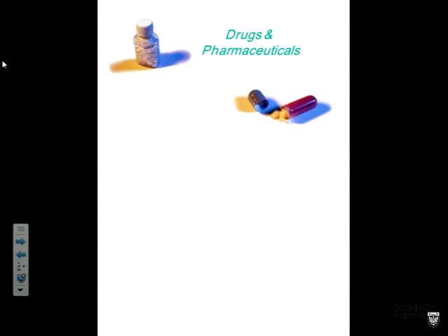Drugs and pharmaceuticals: separation science here is enormously important. In the pharmaceutical industry, I believe around 1 in every 5 pills that are manufactured is broken open and analyzed through separation science to ensure that that particular batch is coming through consistently with the right dose, the right quality, the right purity.